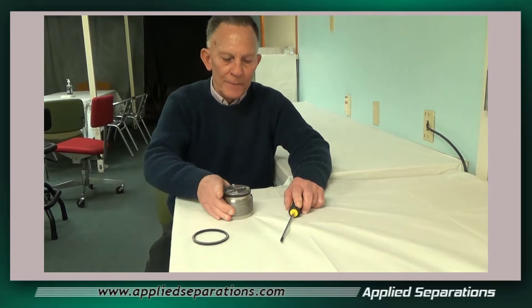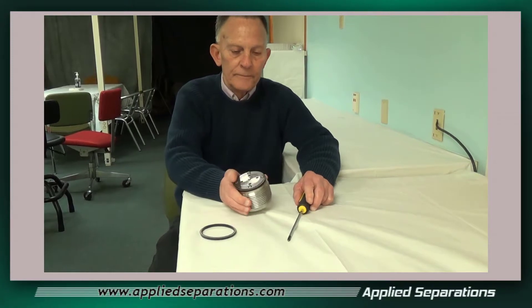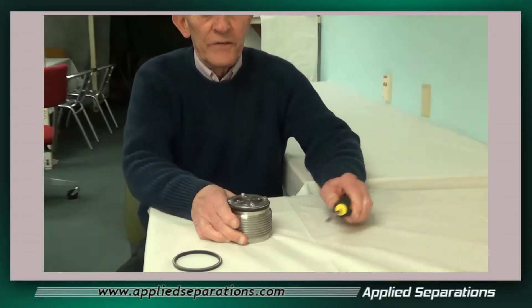I'd like to show you how to change a cup seal on a 500 milliliter or 1 liter vessel. Here we have a cup seal already assembled and we've taken it out of the vessel.